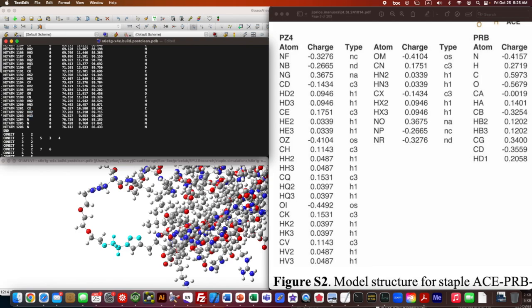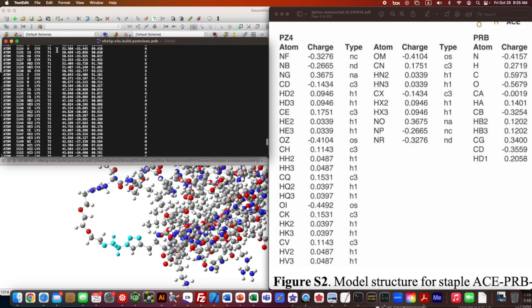So you said the placement of this one doesn't really matter, of where in the PDB file it is? No. I'm counting it as a separate residue, and it's just after the molecule. In PyMOL or in a PDB file, you can specify what chain something goes to. So before, there's a chain designator that goes here, and I called the first subunit A, the second subunit B, and then the staple chain C.